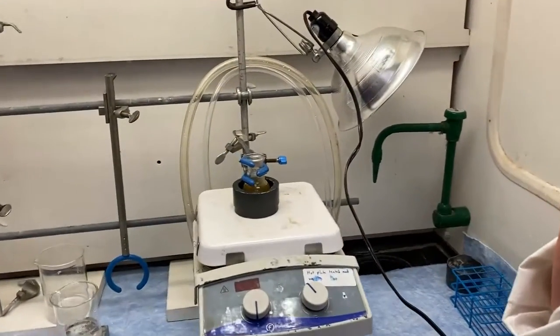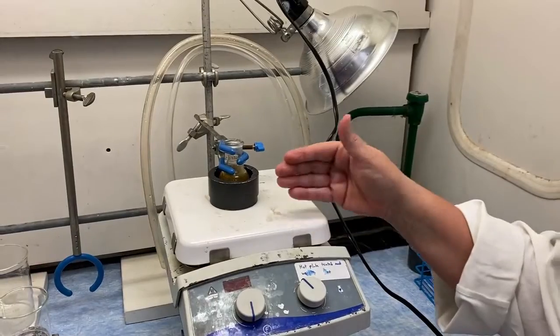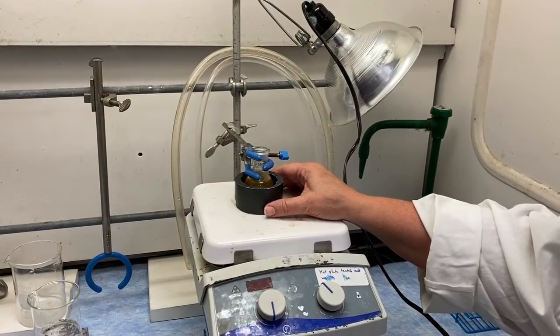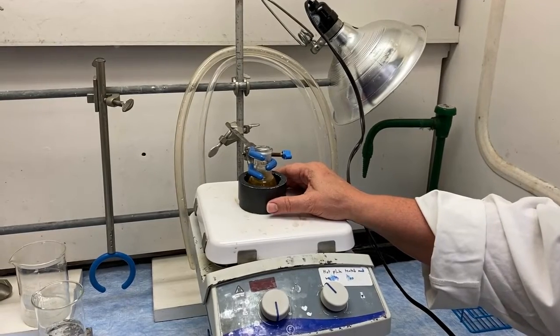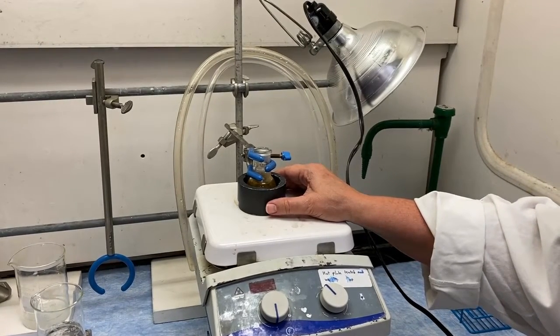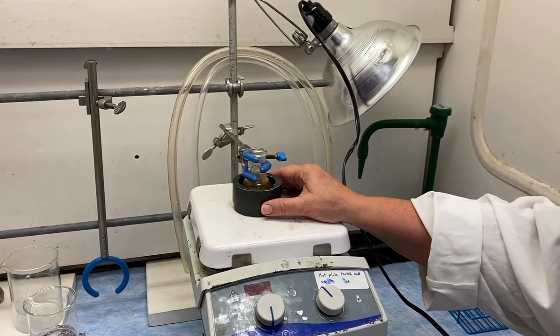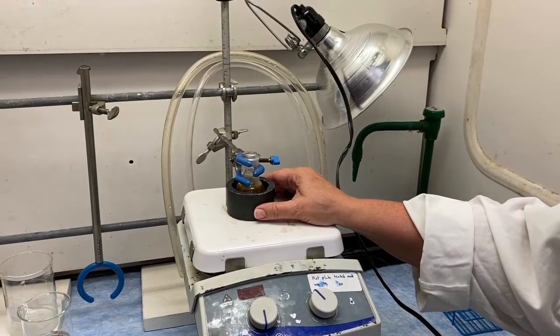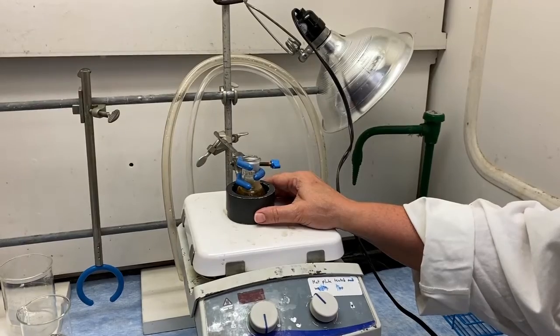This is the amination product. What we have here is a secondary amine. Now, amines are very difficult to isolate. We can't put them on a column because they'll stick to the column. They're hard to selectively ionize because we have other inorganic compounds in here that are also going to form ions. So extracting this would be very difficult.